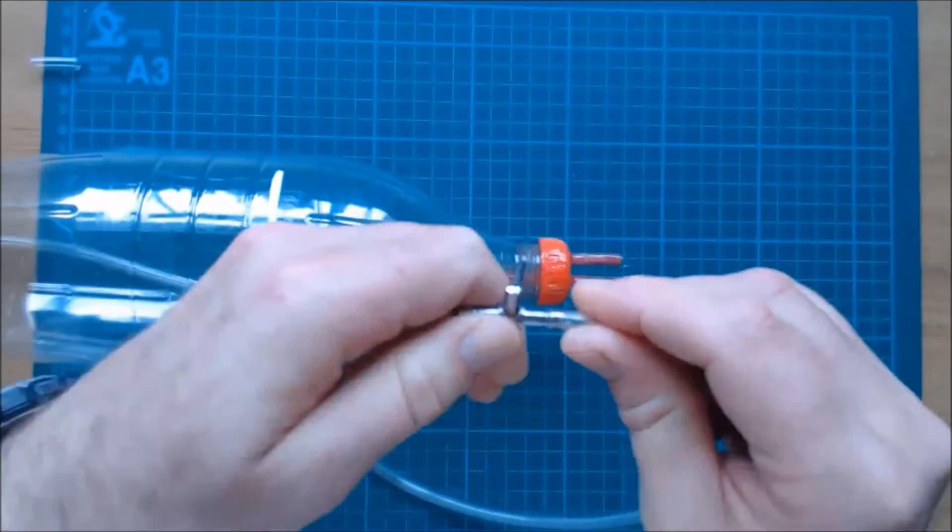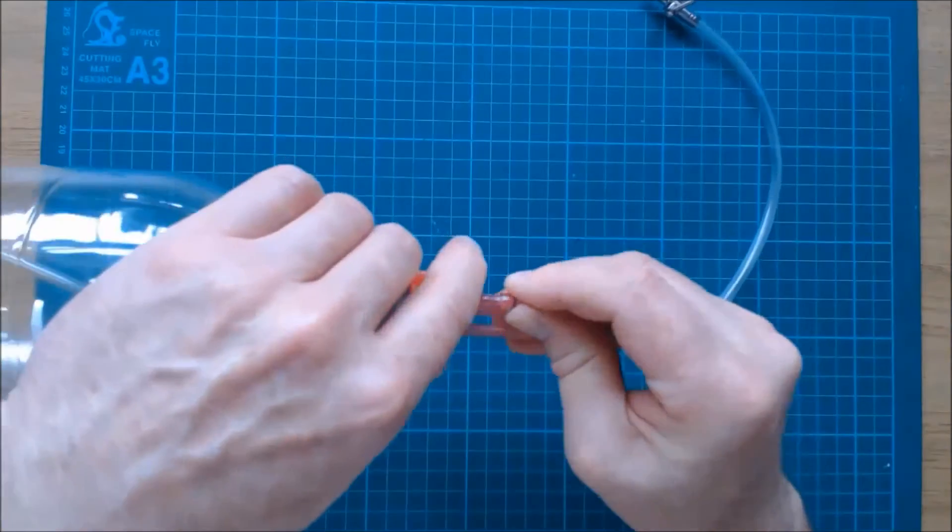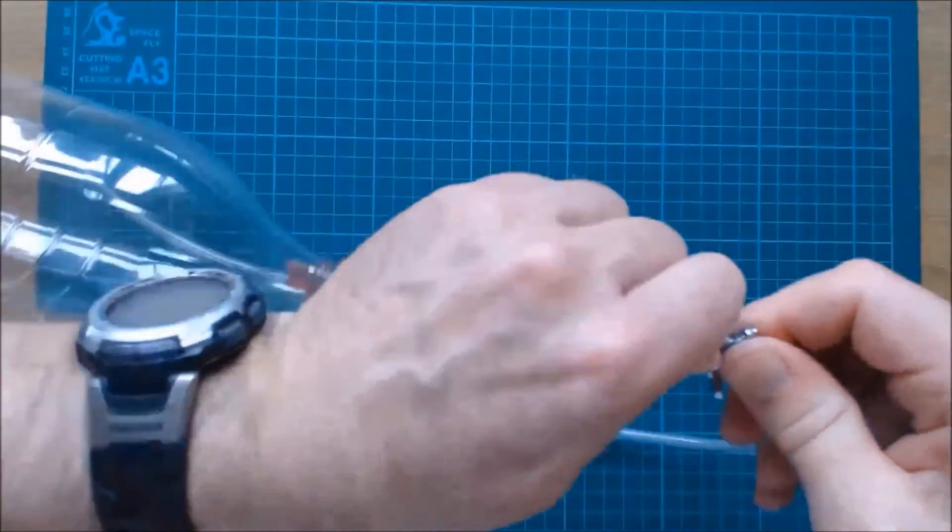Cut a length of pipe and push it onto the tap, and then push the other end onto the short straw of the first soda bottle. Push another length of pipe onto the other end of the tap.